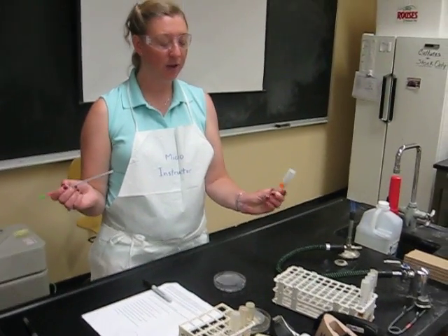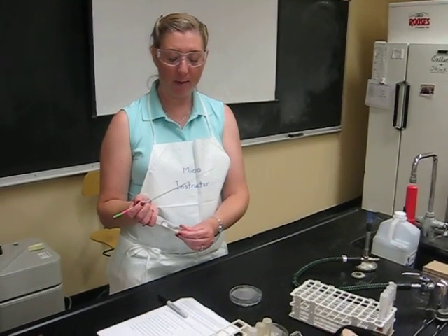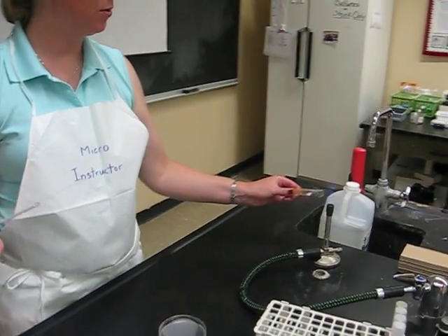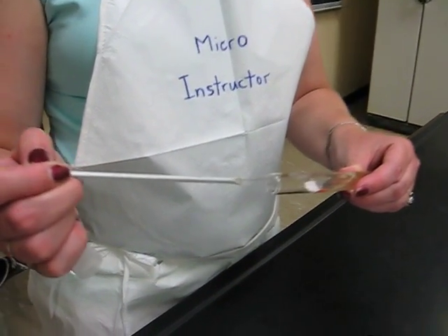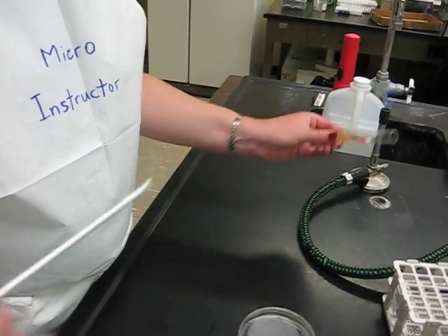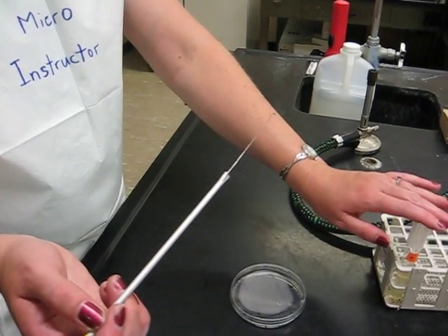Although this is a broth culture, so the broth will cool itself. I'm going to grab the cap with my pinky finger, hold the tube at an angle, prevent airborne contamination, flaming the mouth. Going in, picking up bacteria, trying not to touch the sides. Flame, cap, done. Never touch this again.